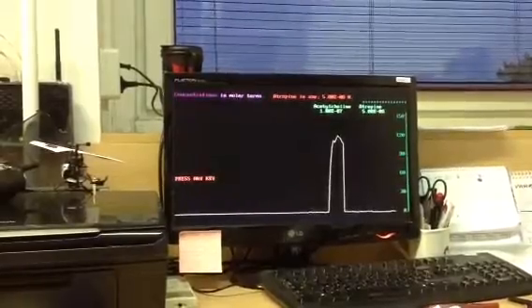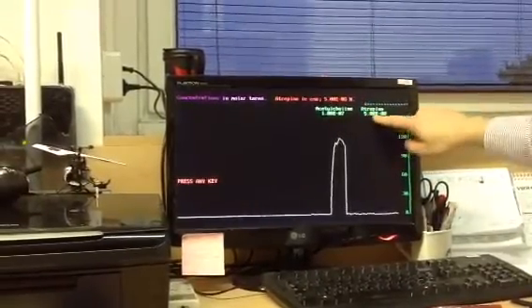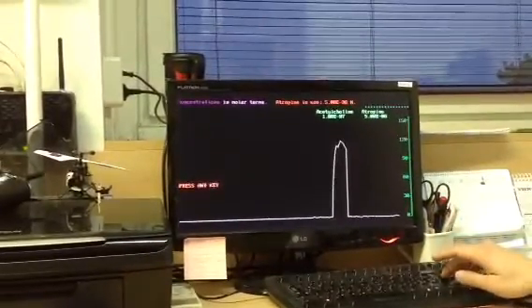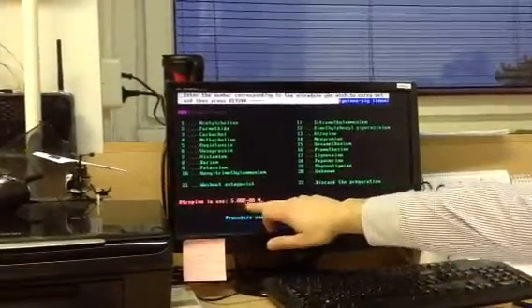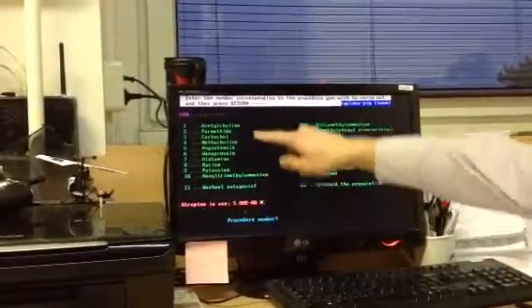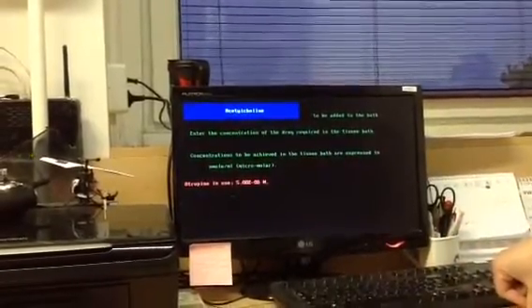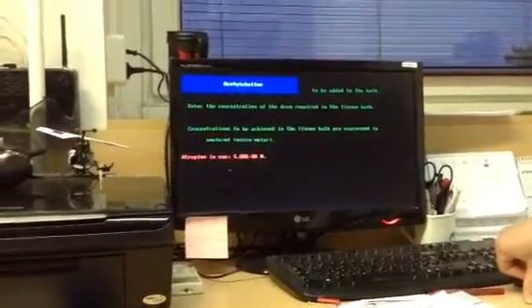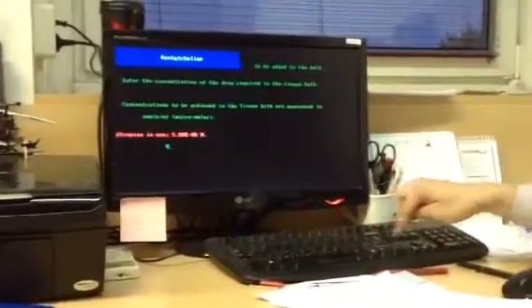You can see that atropine alone causes nothing, and you can see here as well atropine in use in this concentration. Then we choose acetylcholine again, and we should add the same concentration. So first we should add atropine and then the acetylcholine. Atropine and acetylcholine again, the same concentration.